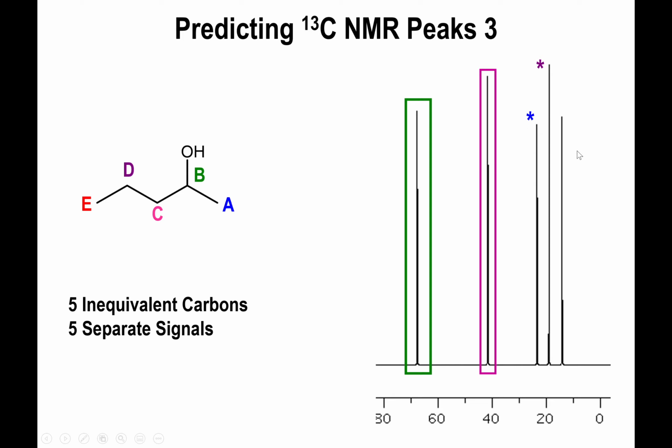And then similarly for the peaks over there, this carbon is 2- in oxidation state, that one's 3-, so you will expect that E will appear the farthest upfield in the spectrum because of the charge and the fact that it's the farthest away from the electronegative element. So these are the ways in which you can determine which one of your peaks are what.